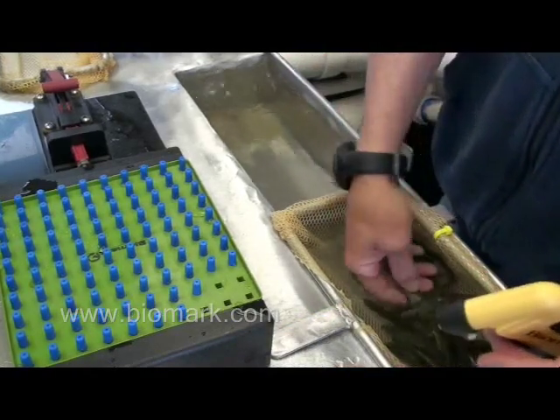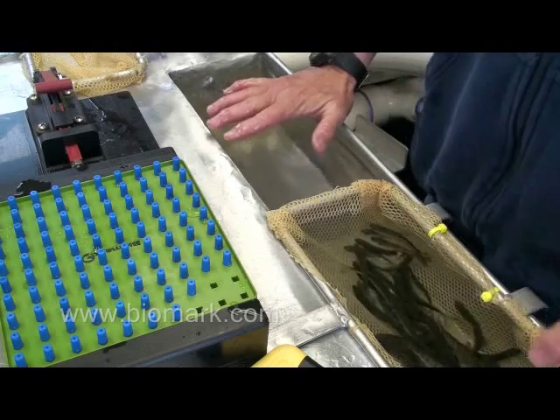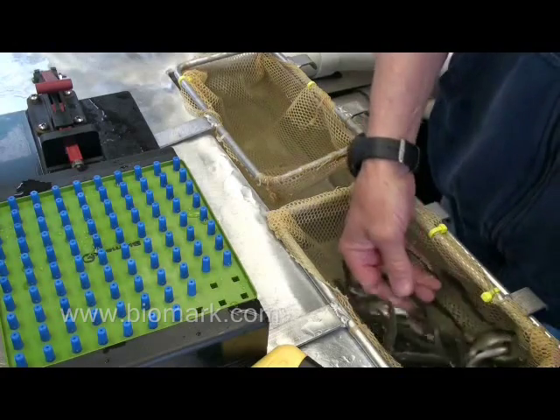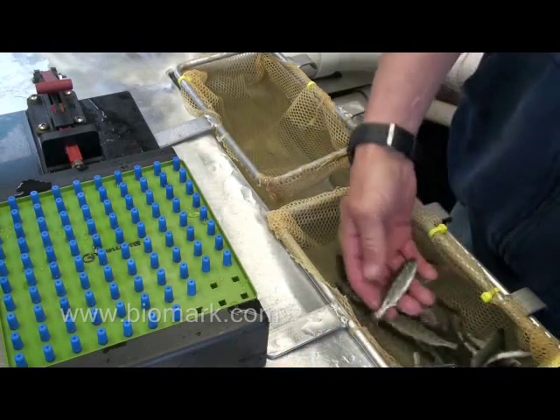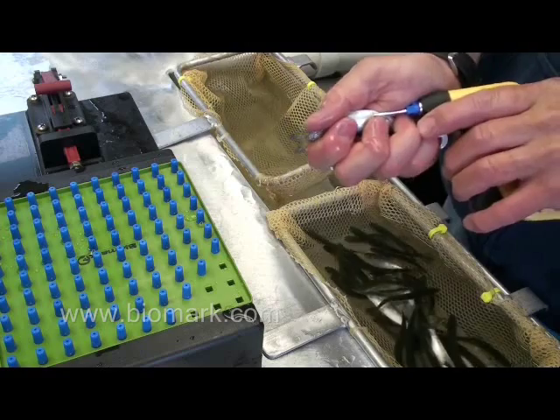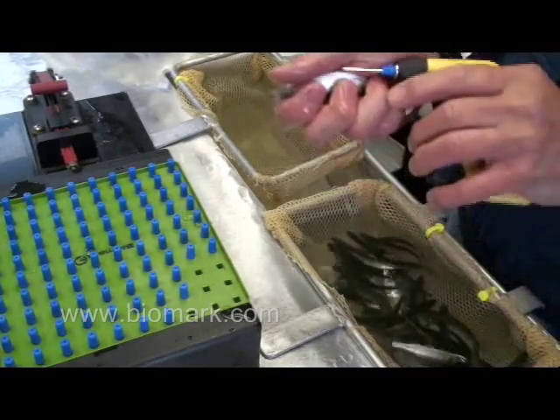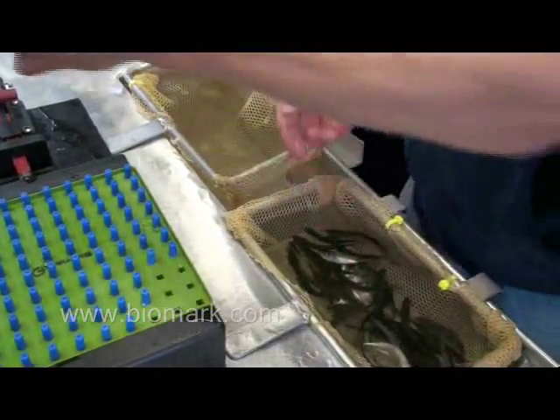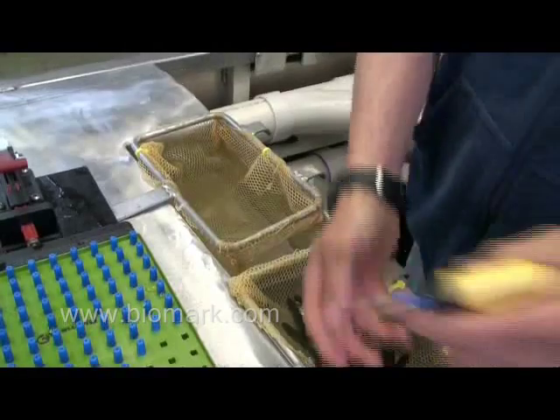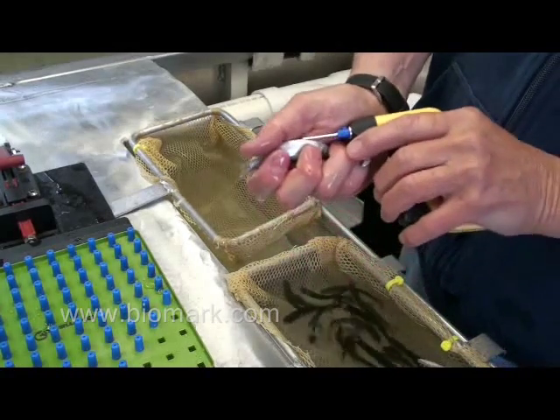We tag fish using a double tray anesthetic system. We put fish in the tray and pre-anesthetize them. Once they're at about stage one of anesthesia — where they're just slightly rolling over — we begin tagging. We don't like to over-anesthetize our fish. Our feeling is that excessive anesthetic kills about as many fish as people who incorrectly tag them. You want to have enough fish in your net so that you can tag them out in about three to five minutes.